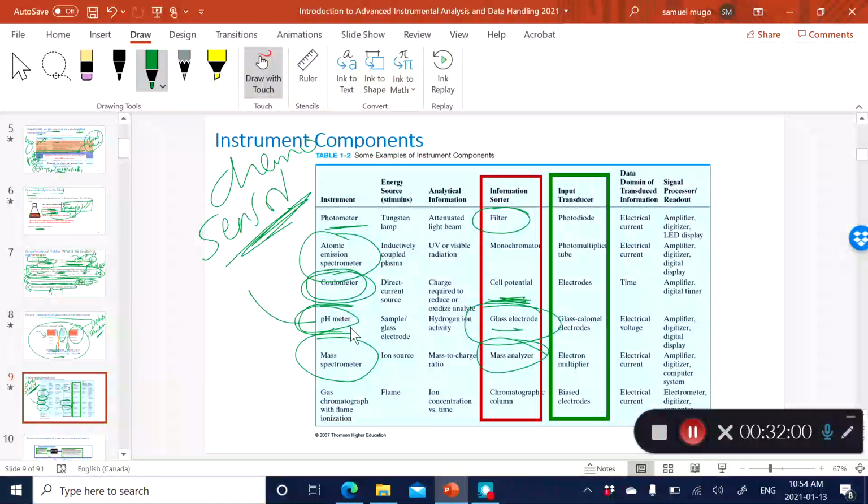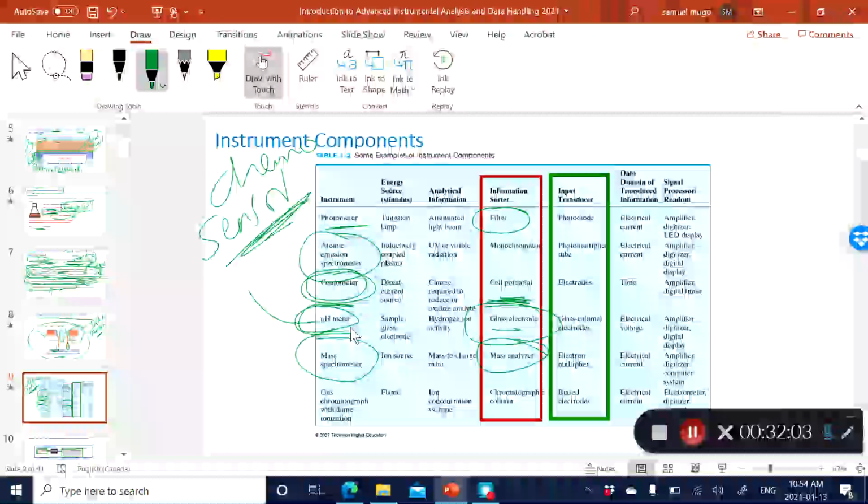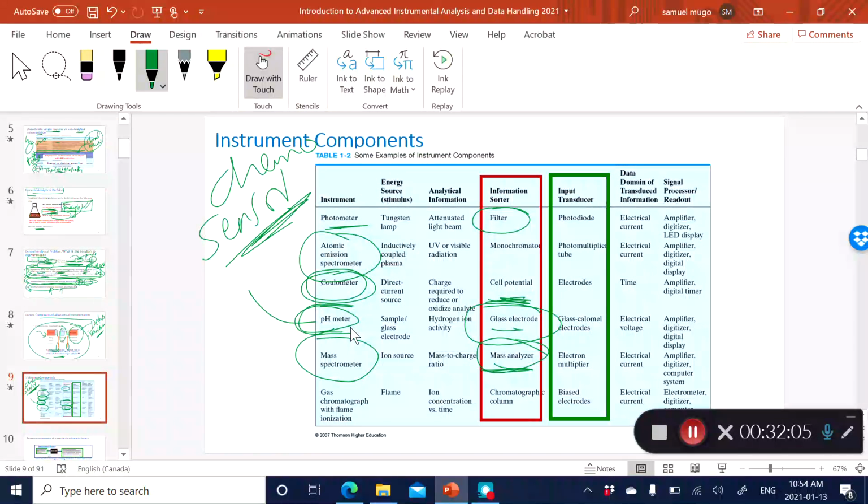You heard me talk about the QTOF, quadrupole time of flight, and so forth. All those are examples of mass analyzers. And what the mass analyzer does is to separate the mass-to-charge ions, or the masses of the analyte, based on their sizes, so it's sort of sifting to separate the masses based on their sizes. Again, you can see how it's addressing the interfering effect.